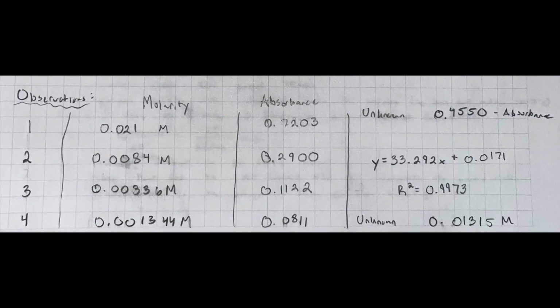This is our data and calculations in correspondence to the volumes, 1 being our stock solution and 2, 3, and 4 being the following dilutions.